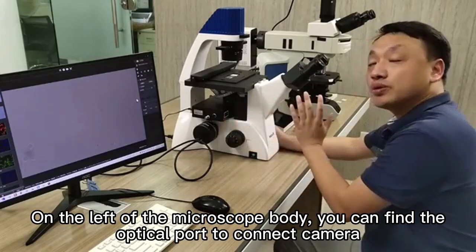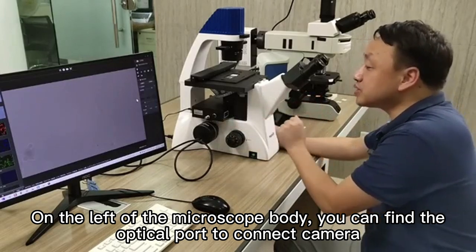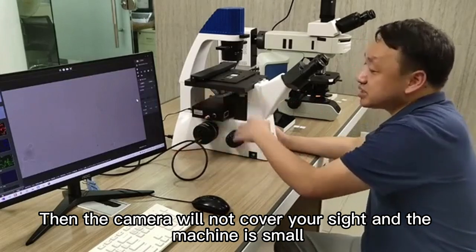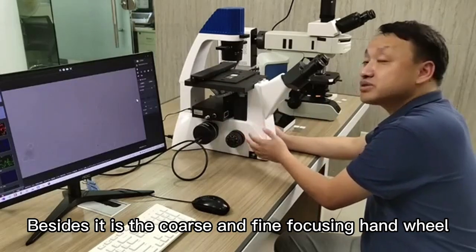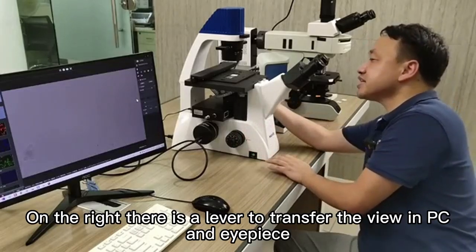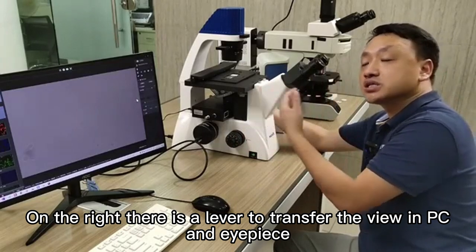On the left of the microscope body, you can find the optical port to connect the camera. Then the camera will not cover your eyepiece sight and the machine remains compact. Besides, it has a coarse and fine focusing hand wheel.